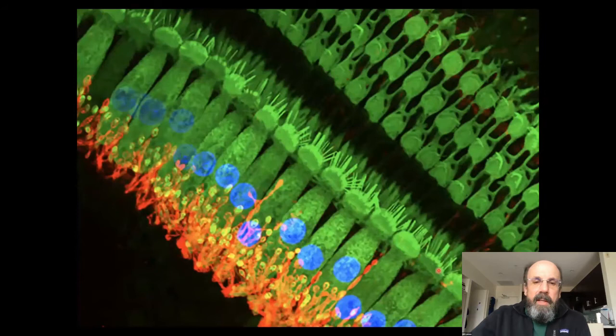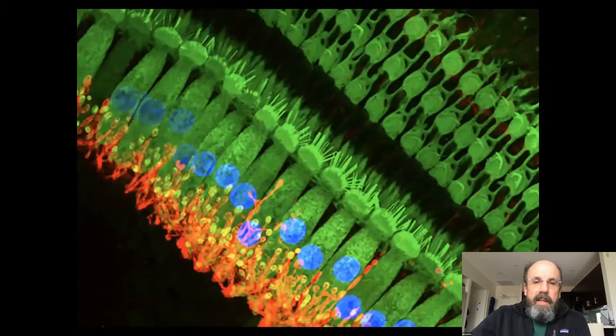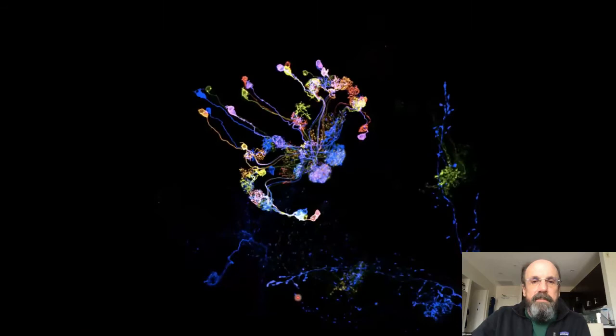We use these all the time at Janelia. Here are some other nice multicolor confocal images: hair cells from the human inner ear in green, nuclei in blue, and neurons associated with the hair cells in red. And this is another fruit fly brain — the central body with a population of neurons each individually labeled with a different color. You can get really nice pictures with confocal microscopes.